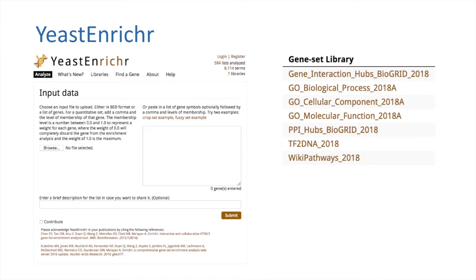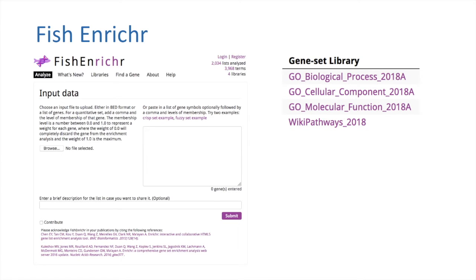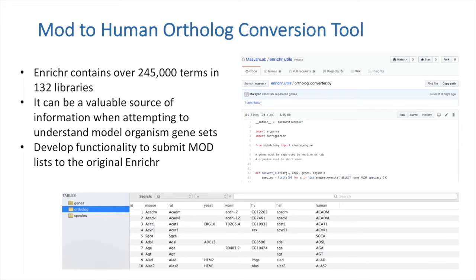Yeast Enricher is an expansion of the Enricher platform for Saccharomyces cerevisiae. Fish Enricher is an expansion of the Enricher platform for Danio rerio. With the specific organism Enrichers being built off the same platform, we wanted to facilitate cross-species research. Additionally, the original Enricher has over 125 libraries built from a wide variety of data sources.